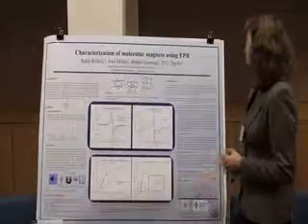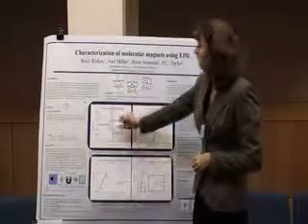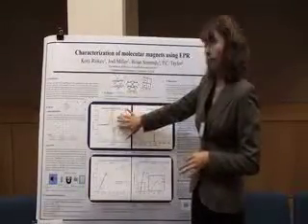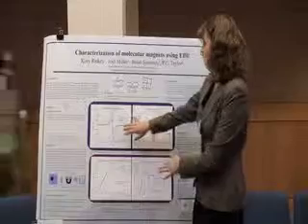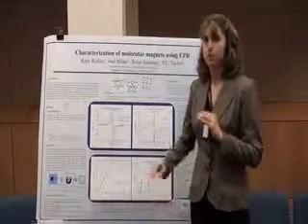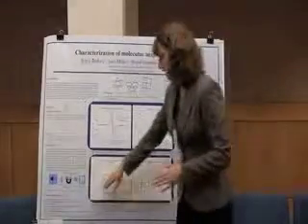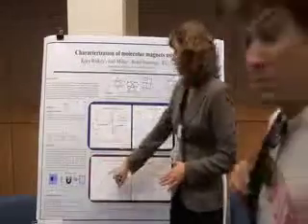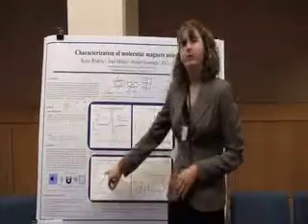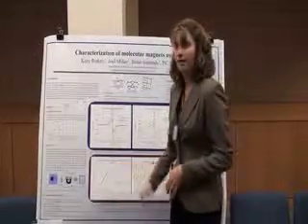For our data, we can see that for this line shape, for our samples, both of them, the intensity increases with lowering temperature. So there's more ordering at lower temperatures. Where it deviates from this exponential behavior is where it's exhibiting ferrimagnetic behavior, which is what is useful to us.